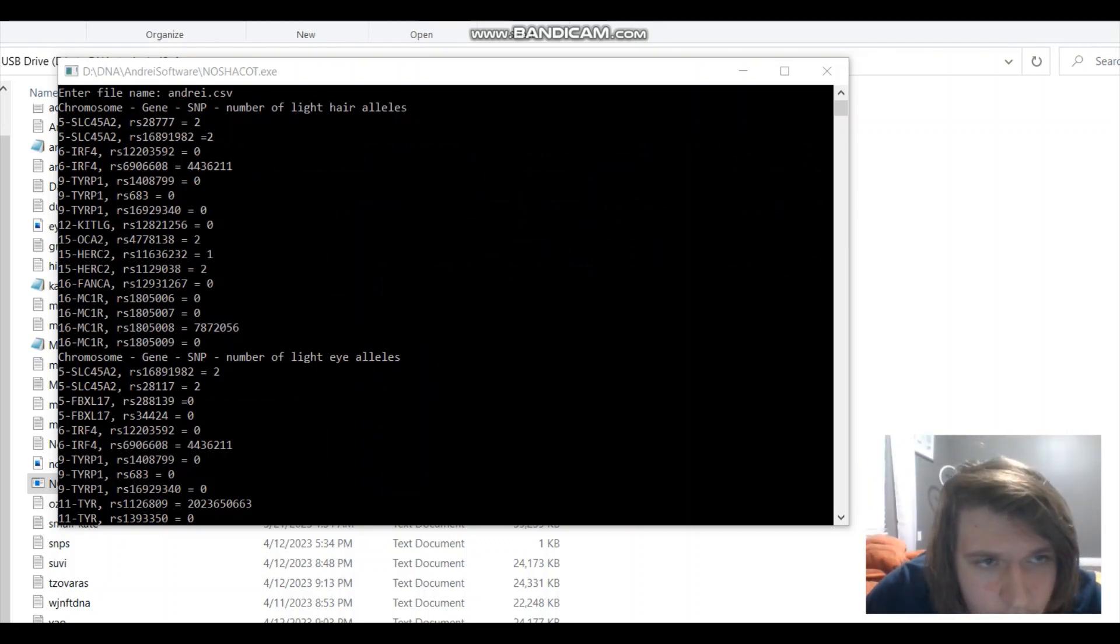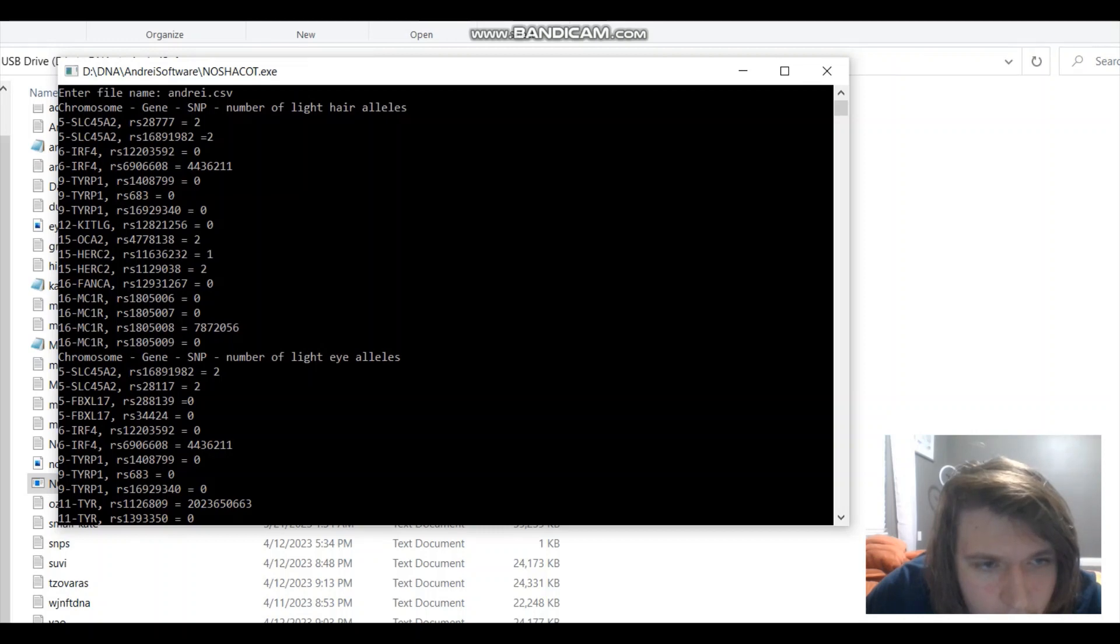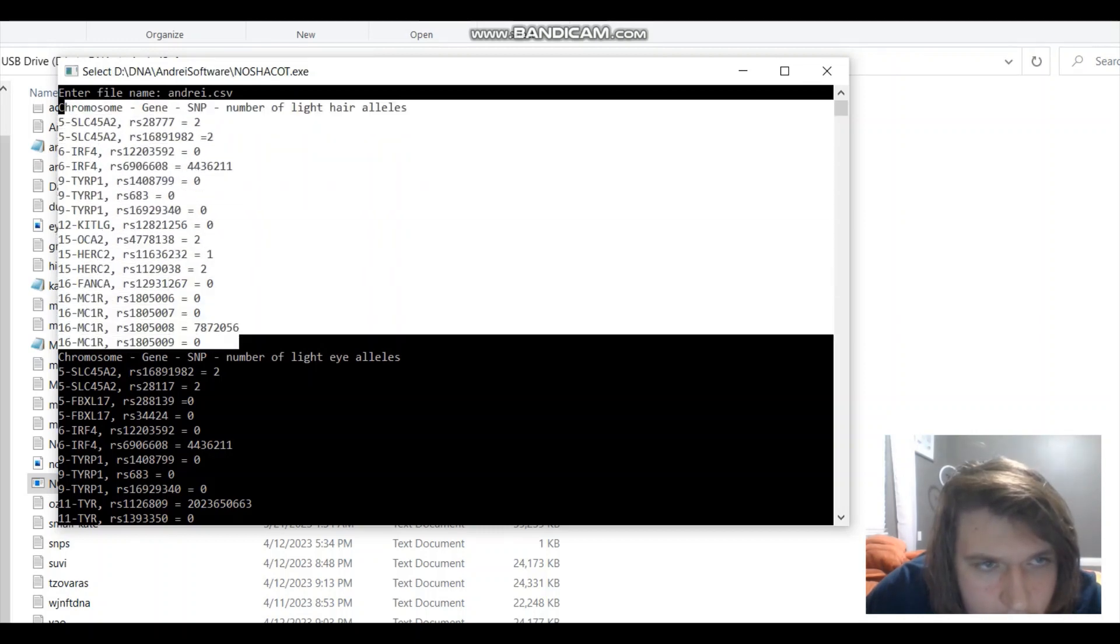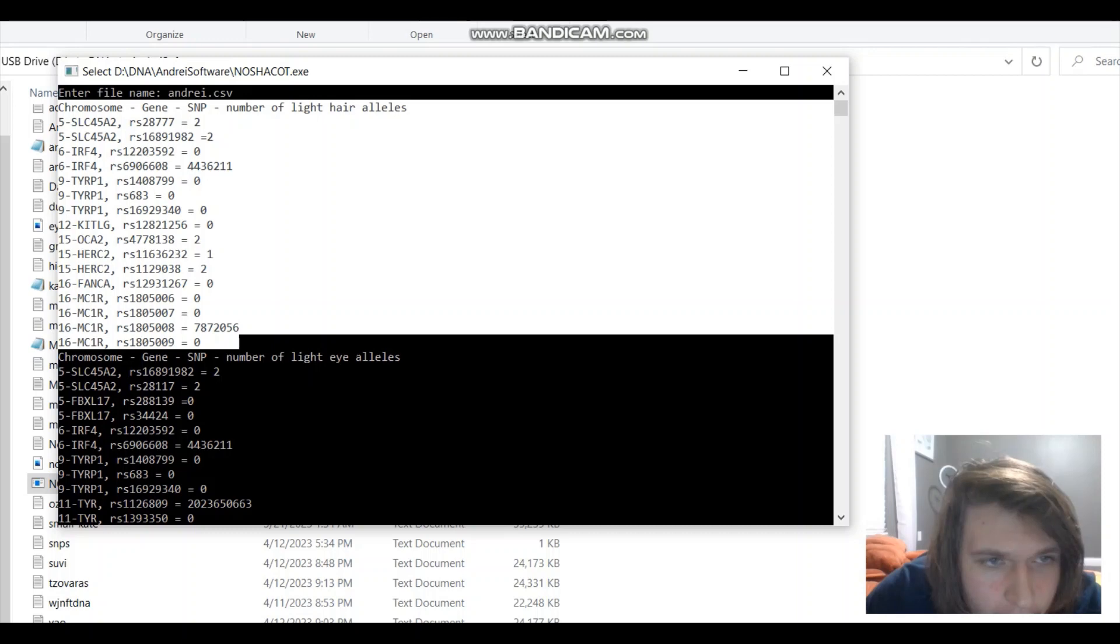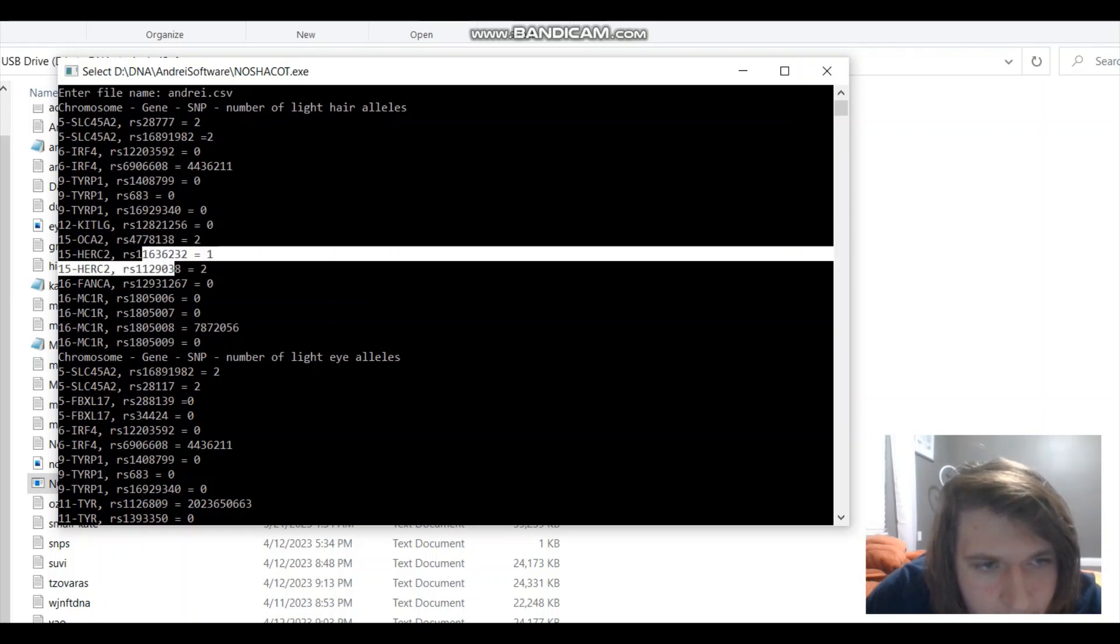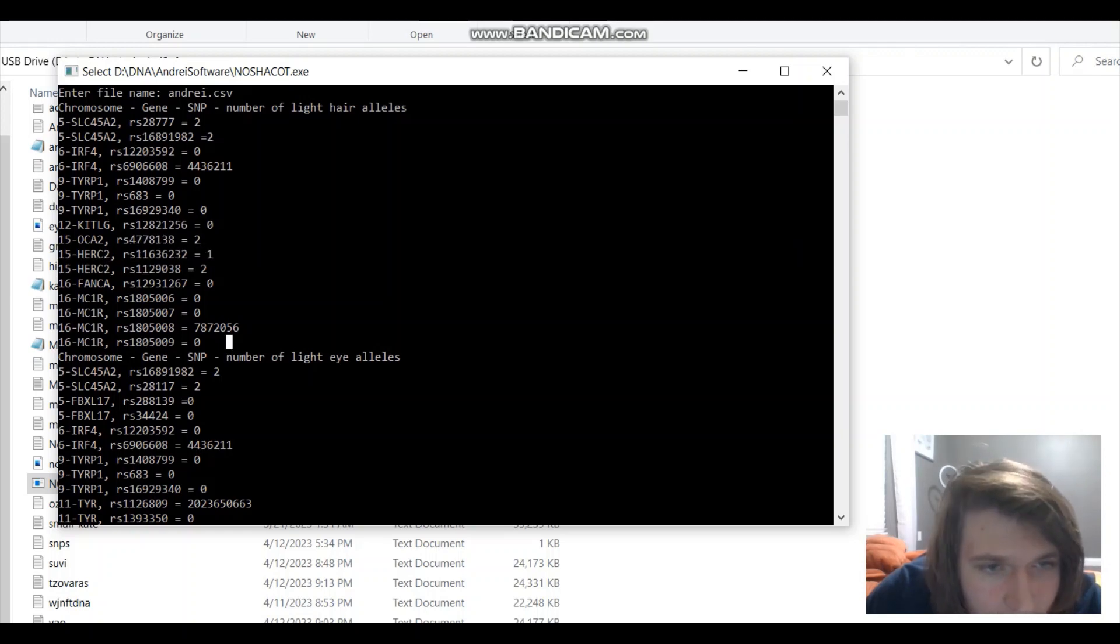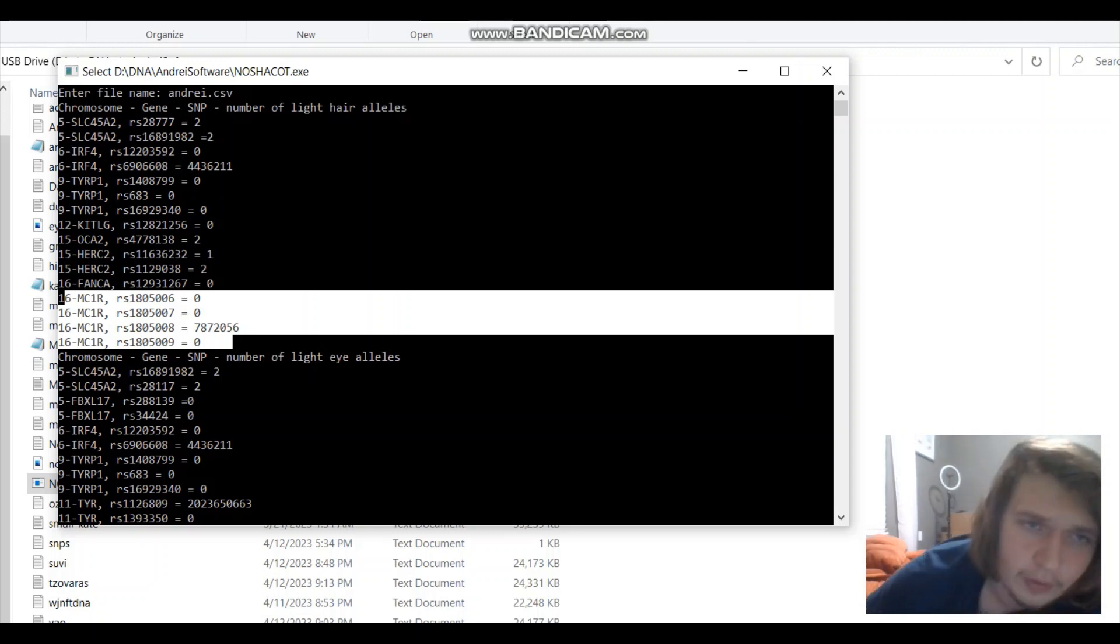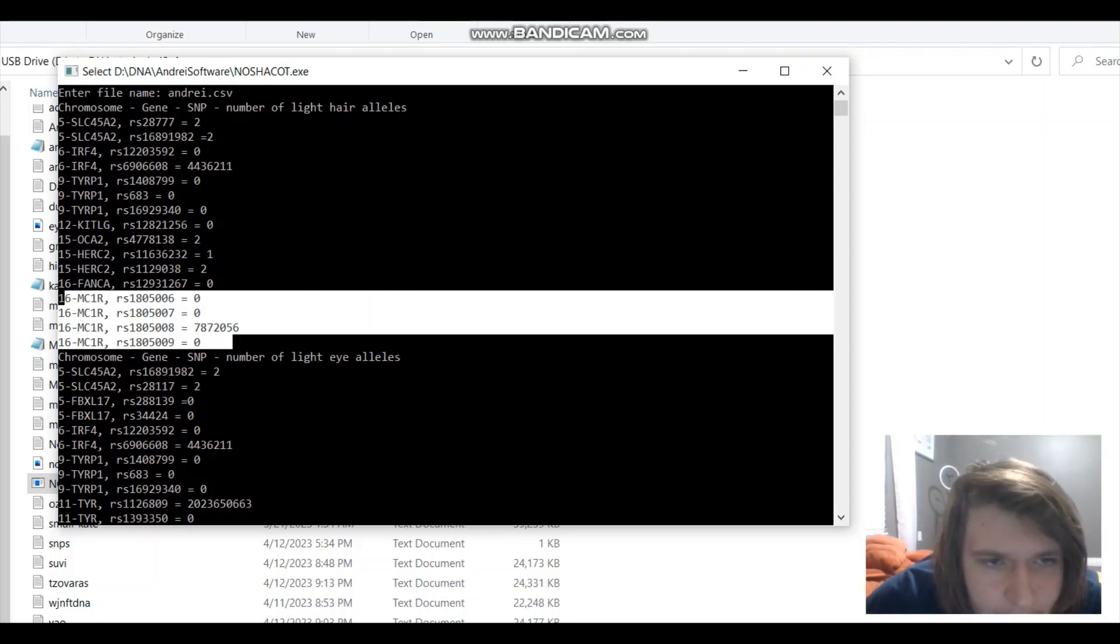So, let's look at what we actually get. First we get this. It's a list of SNPs that are used for hair color calculation. So, SLC45A2, IRF4, TYRP1, the genes KITLG, OCA2, HERC2, FANCA, MC1R. That's basically the genes that my software looks at to analyze hair color.